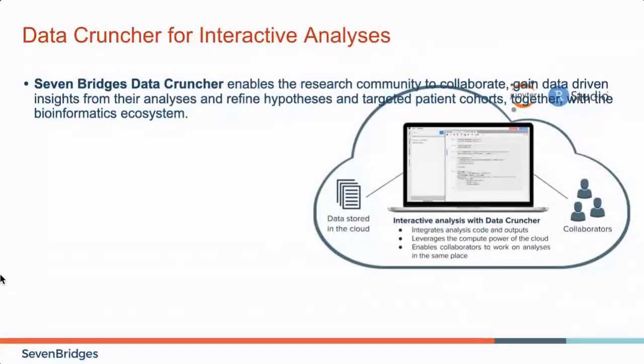And we also have a set of tools for running Jupyter and R packages in the cloud as well. So not only do we have the tools to do primary data processing with our tools and workflows, we also have integrations that allow you to run notebooks and RStudio packages in the cloud as well. So without having to download the data, you can take the results of your analyses and then go on and do more complicated higher level analyses or visualizations directly integrated with your same project in the cloud.